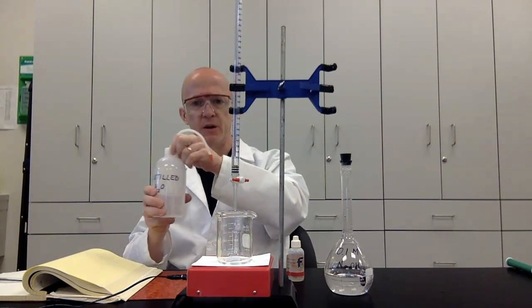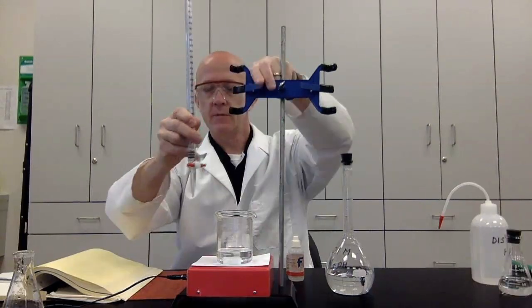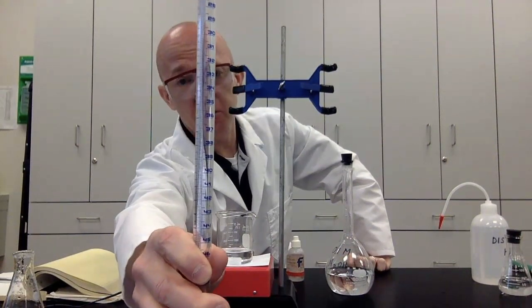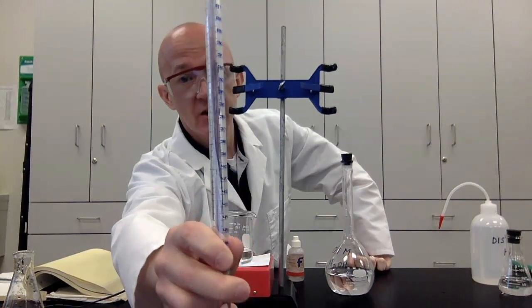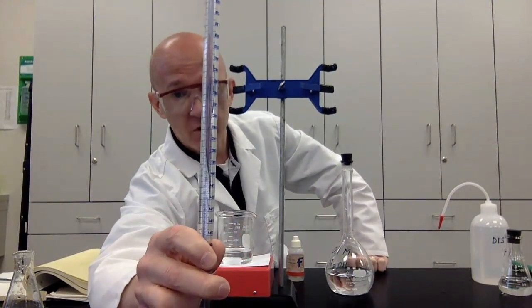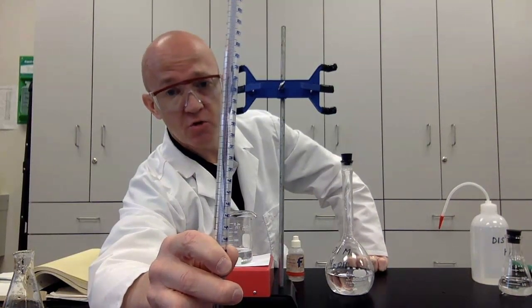I'm just going to pour a little bit of this distilled water in here just so I can see it a lot more clearly. Now this is called a burette, and you'll notice it has numbers on it. It's graduated, like a graduated cylinder. And these graduations are pretty precise. I can use this to know exactly how much volume I start with and I end with. In other words, how much volume of this NaOH I'm going to use to neutralize this acid.